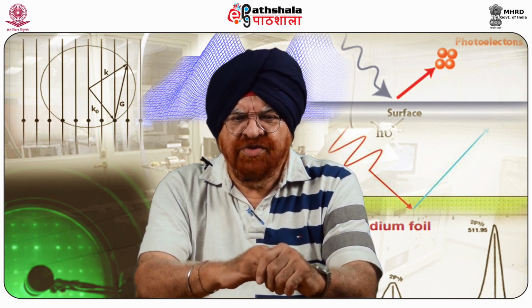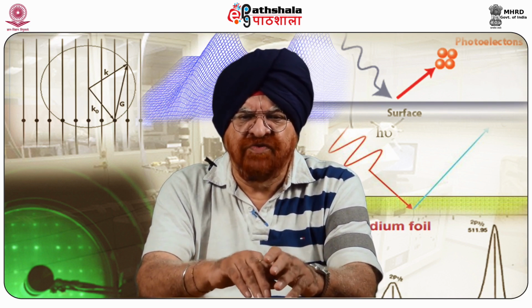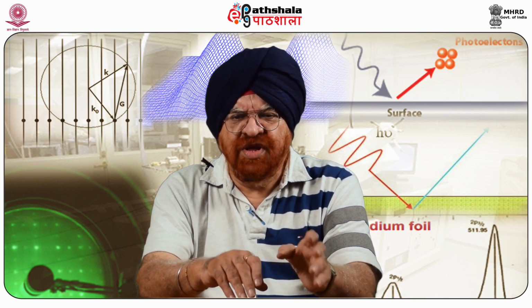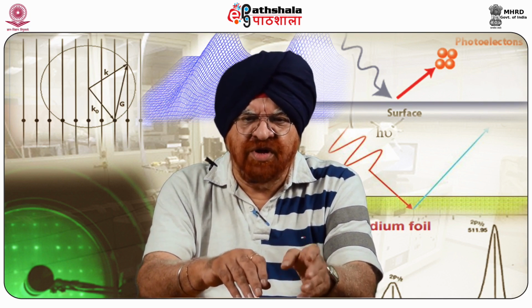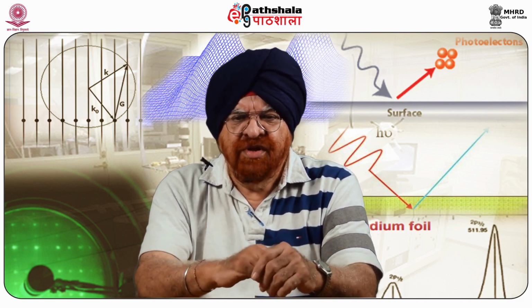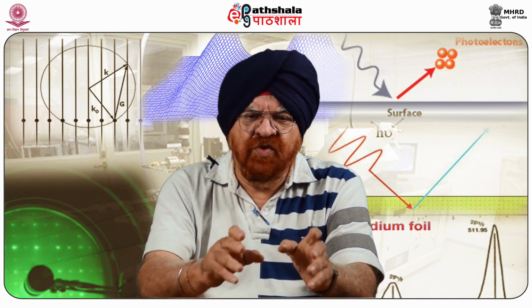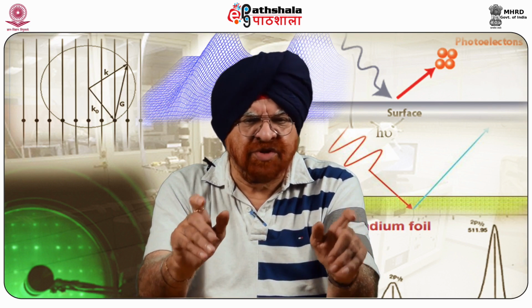Continuing with the summary of this particular KPFM technique, we find, however, that the operation of KFM implicitly relies on the presence of a linear lossless dielectric in the probe-sample gap, a condition which is violated for ionically active liquids. Therefore, this cannot be used in such a condition. For example, when diffuse charge dynamics are present, we cannot very effectively measure these diffuse situations.